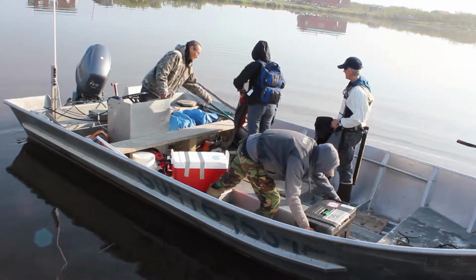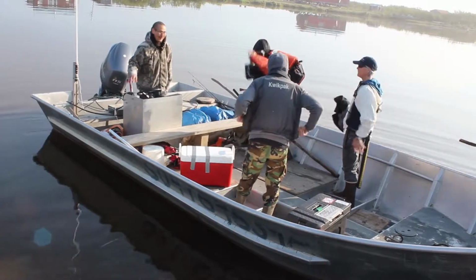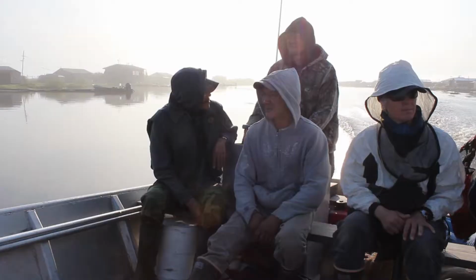Once you have everything ready to go, it's time to pack up and head back to the landfill for some sampling.